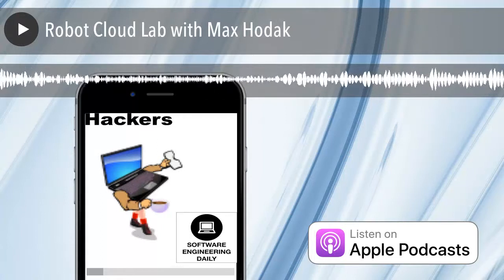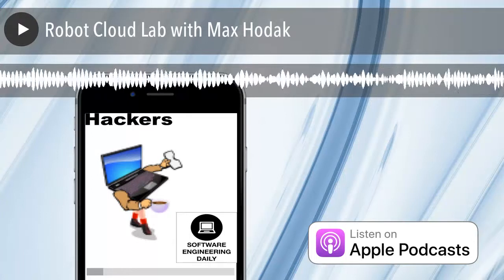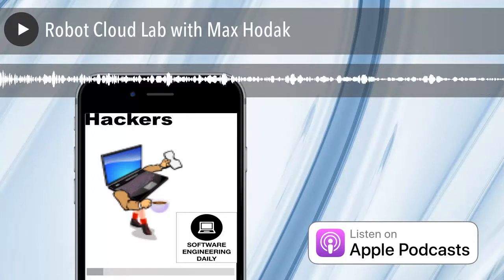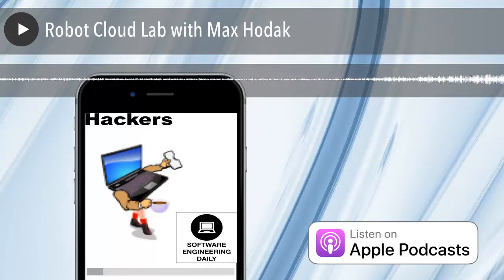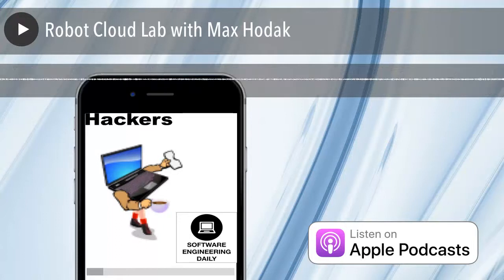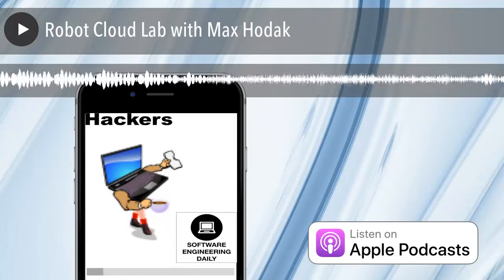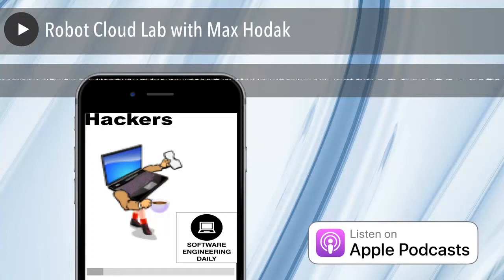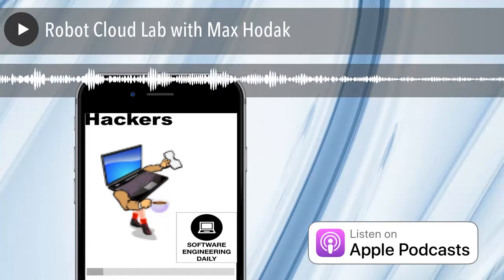No, there's definitely progress. I'd say that one of the reasons it's so difficult for us is because there aren't that many people that really want to automate at this level. So the bulk of the market for these devices are people that have benches or have lab space. And so the idea of controlling it programmatically without Windows in the stack, that's a fairly uncommon use case. So there's progress happening on three fronts. The first is just in terms of the instruments and their fundamental capabilities. The second is in the software to integrate them. And then the third is software to control them in general. And then the third is to integrate them with robotics. And there is progress happening in all three.